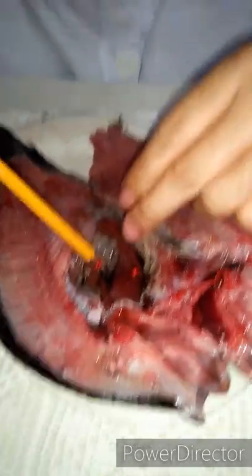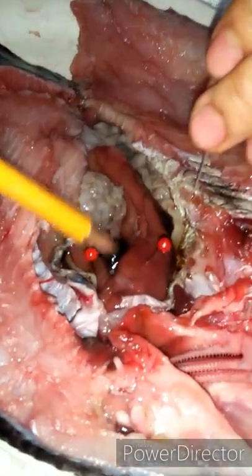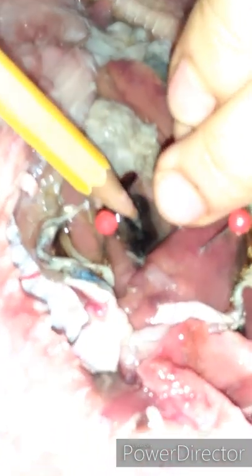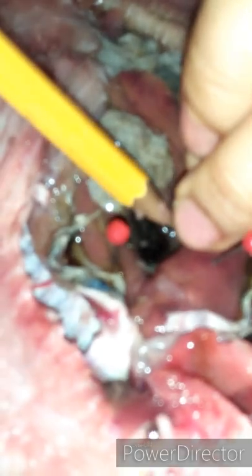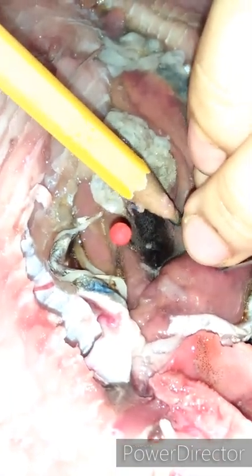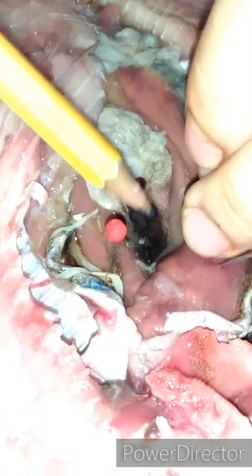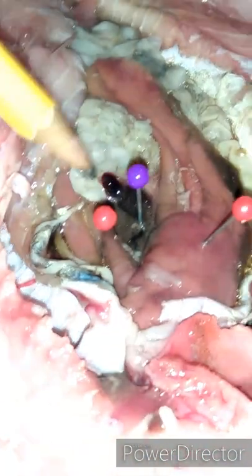Now we are going to find the liver — this one here is the liver. It assists in digestion by secreting enzymes that break down fats, and also serves as a storage area for fats and carbohydrates. This dark-colored organ here is the liver.